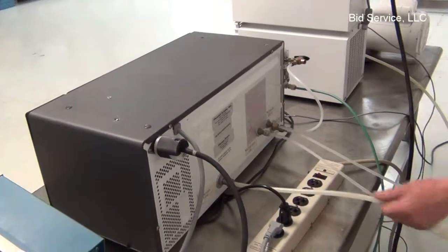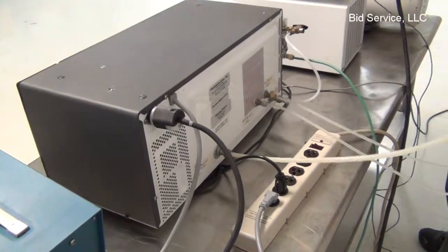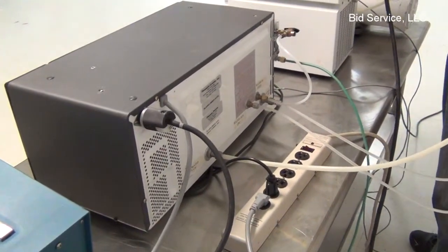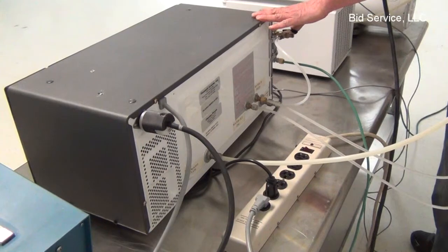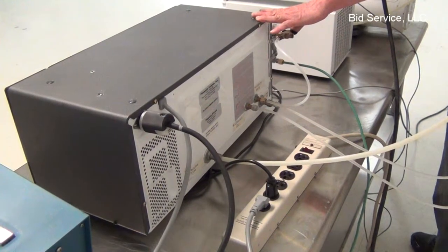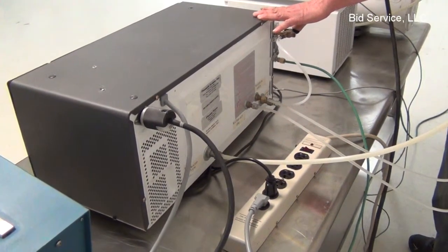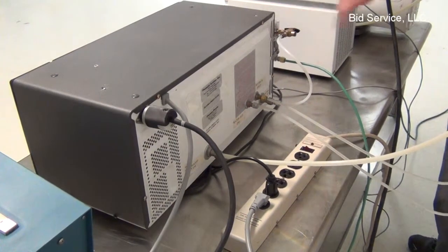The connections are, first, vacuum. We have a vacuum pump connected to the microwave oven, capable of developing 3 cubic feet per minute of vacuum to the levels of 50 microns.